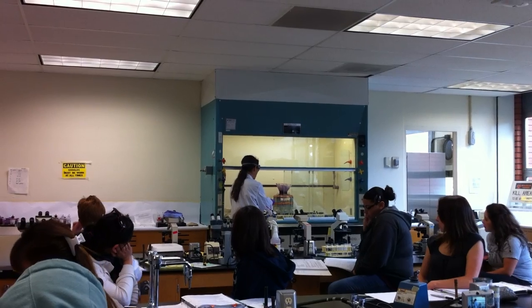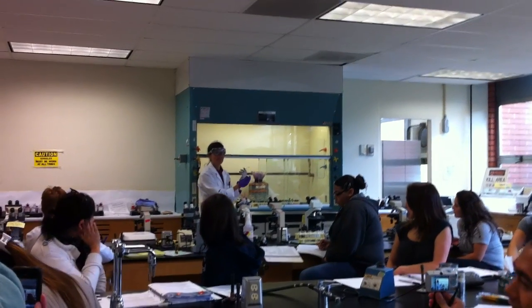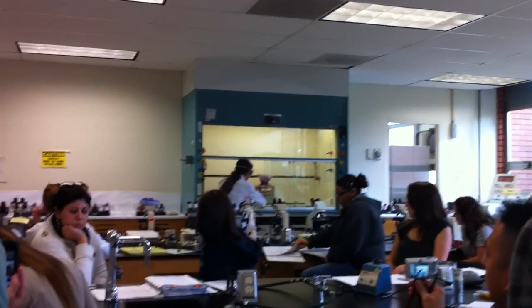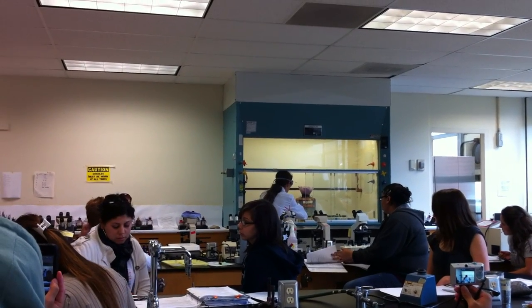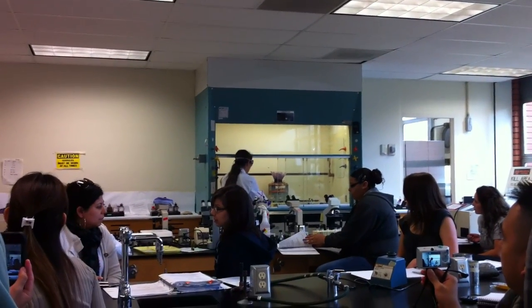And help me out, you guys. In the directions, how many drops do I add? 15 drops, right? And this, you guys, is so hard. These little things are so hard to squeeze. But just be patient. You just add it drop by drop. It says 15. 2, 3, 4, 5, 6, etc. Okay, we'll pretend that I've added my 15 drops.